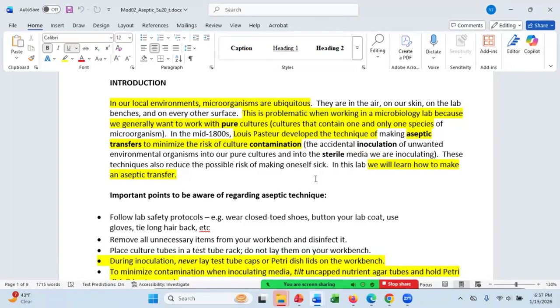And what he would do was have a liquid solution containing various microorganisms, and he would then make multiple dilutions of that solution, making 10 replicas at each dilution.